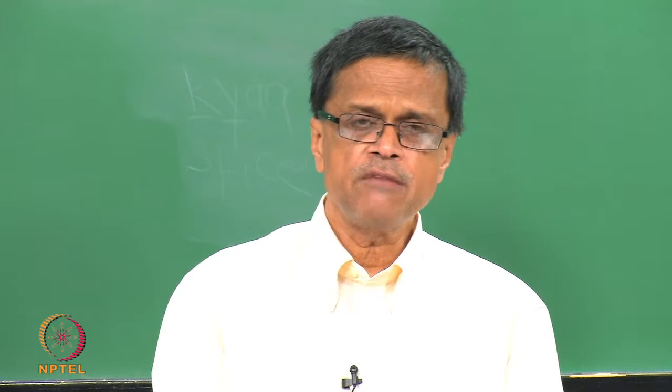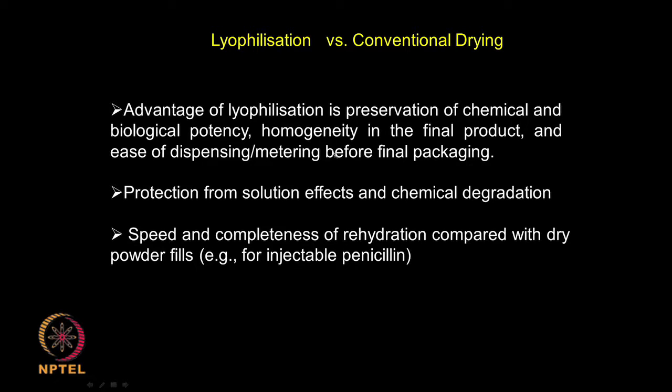Okay. So, what are the advantages and disadvantages? Advantages of lyophilization: preservation of chemical and biological potency in the final product, protection from solution effects and chemical degradation, speed and completeness of rehydration compared with dry powder. Okay, it can be quickly rehydrated again following lyophilization.